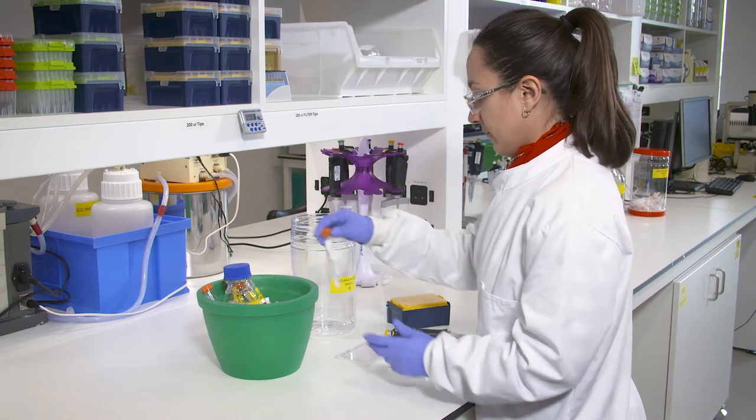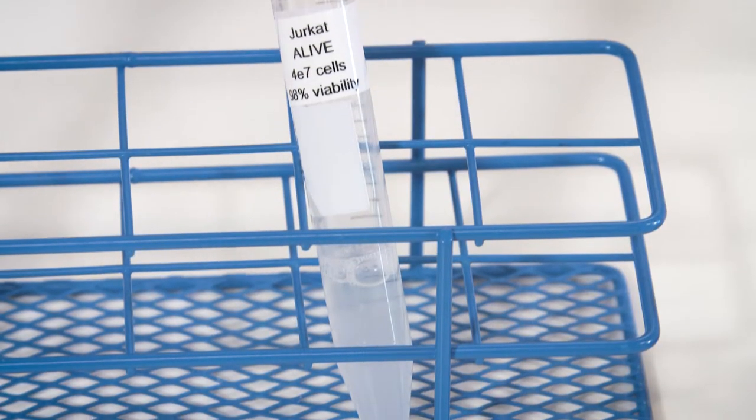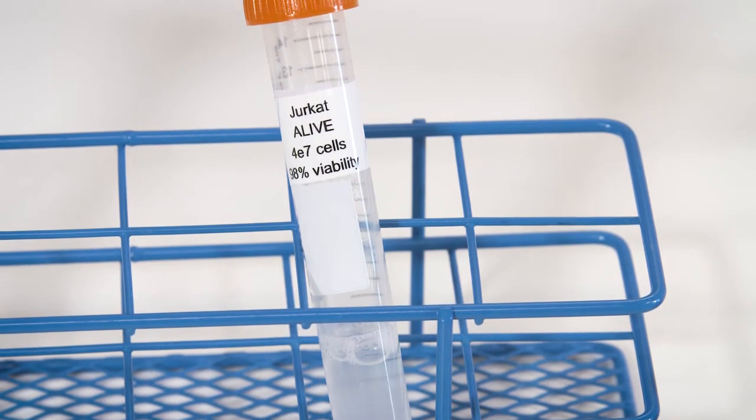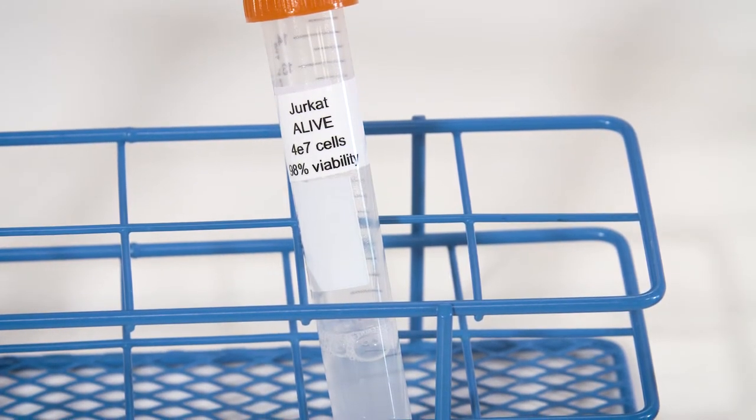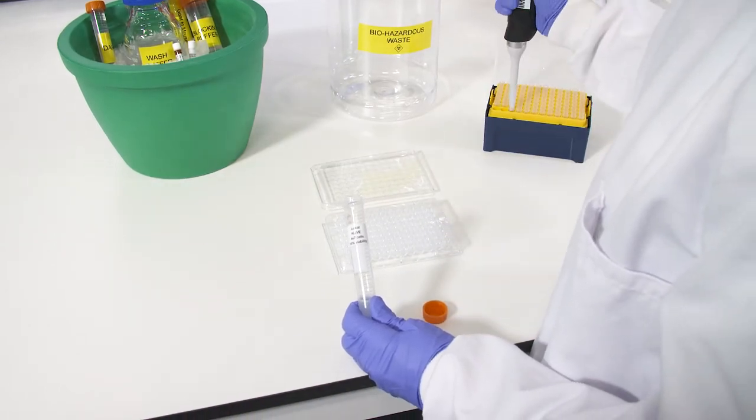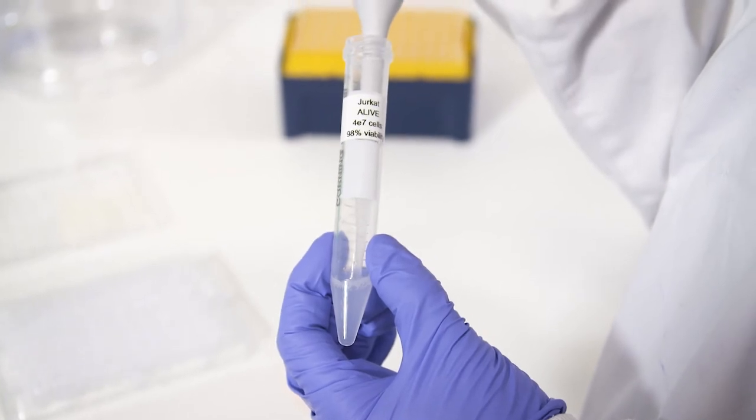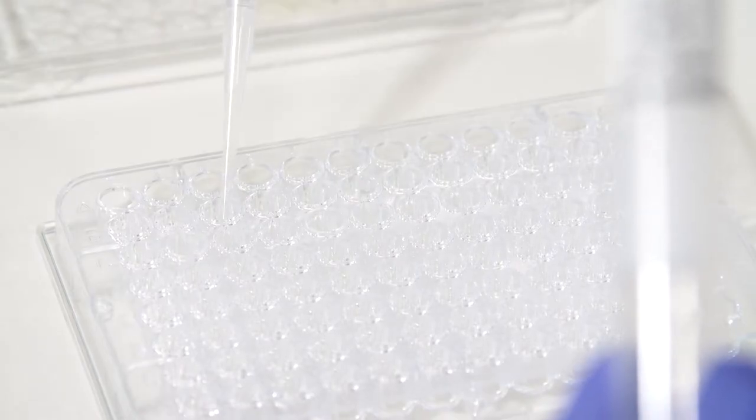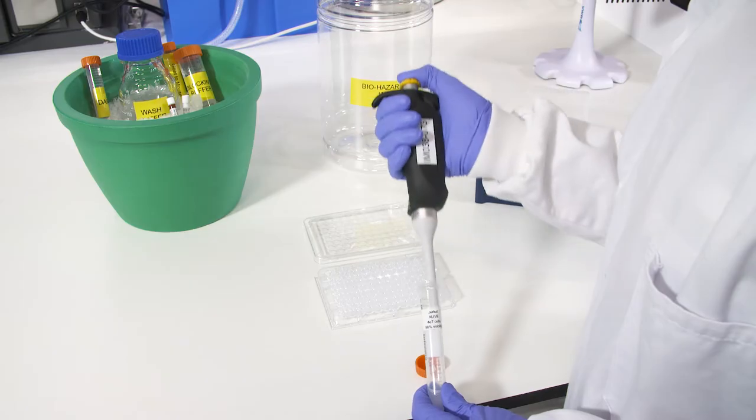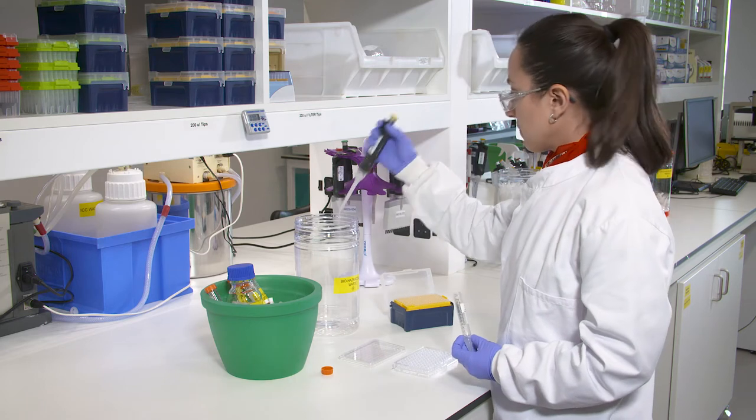After washing your cells, resuspend them at approximately 1 to 10 million cells per ml in ice-cold wash buffer with sodium azide. Add 100 microliters of the cell suspension to a 96 well plate with a U-shaped bottom. Cell viability should be measured using a marker for live and dead cells. Viability should be around 95% and not less than 90%.